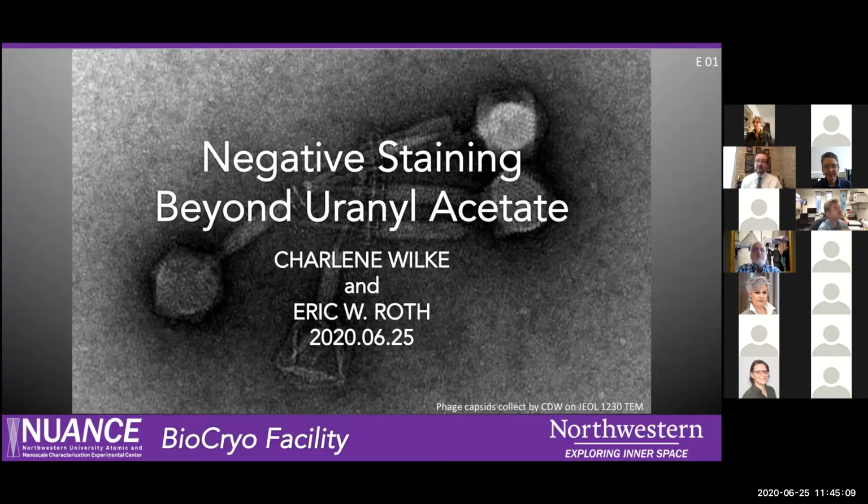Charlotte Chen is asking, what is the least toxic negative stain? I sure agree with, you know, UA is super depleted, so it's not throwing out tons of rads, but that definitely is a concern. There are a lot of less toxic stains out there. Platinum blue is a newer one that is recently available commercially, and it utilizes platinum, so it's not quite as toxic. As I mentioned before, there's ammonium molybdate. Obviously we want to stay away from any lead-based stuff, so we're not doing any lead staining for negative staining anyways.